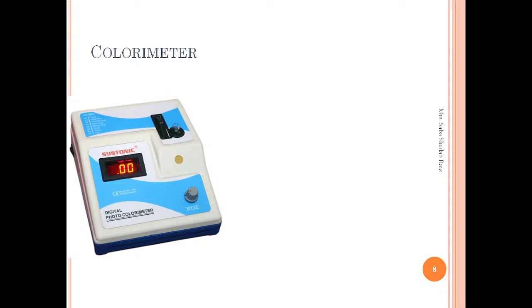If it is absorbed completely, that means the matter is black in color, or maybe this particular matter is an opaque system. So this is also no use. But if it is partially absorbed, some will be absorbed and some will pass through.